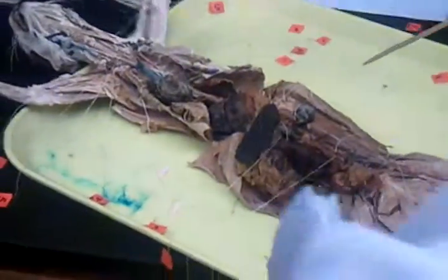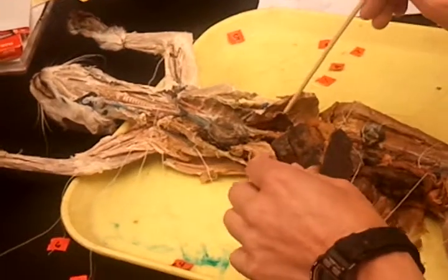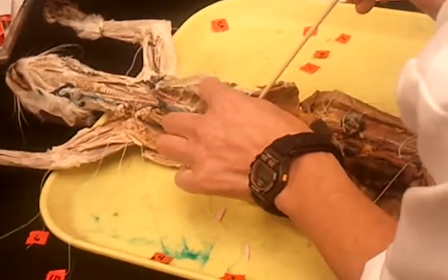Okay. Now, let's see. Touch the cat. Now we're going to follow the descending aorta down. No, I don't think anything can be transferred from crispy crunchy at this point.